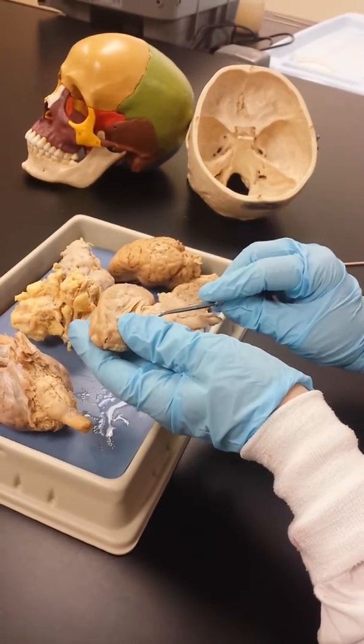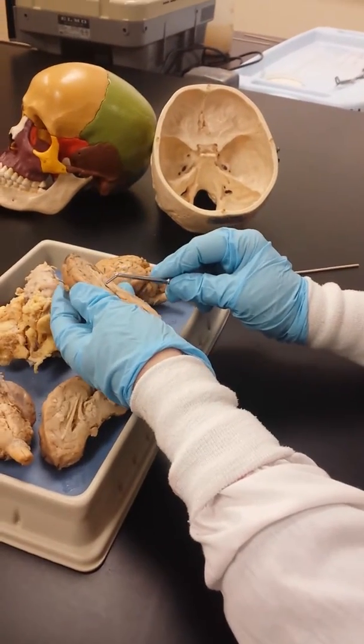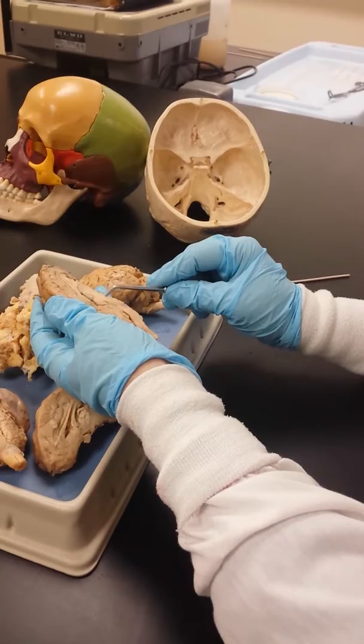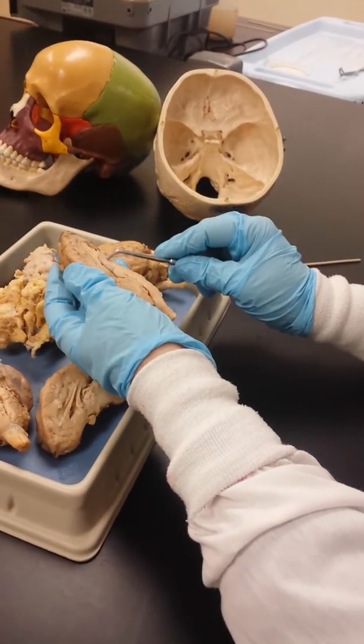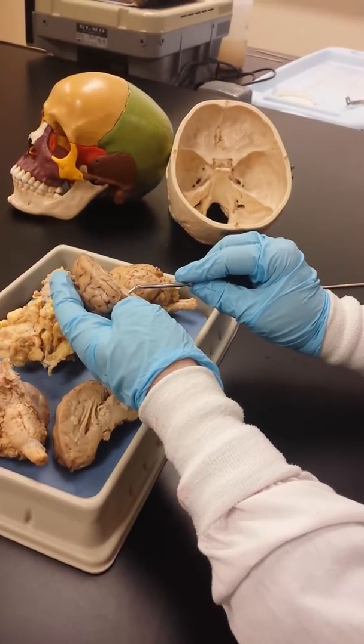And so then it's going to come through, and if you look very carefully, so here's the ventricle, you'll be able to see, you can't see it very well on here sometimes, you can see it getting into the third ventricle. This here is the third ventricle.